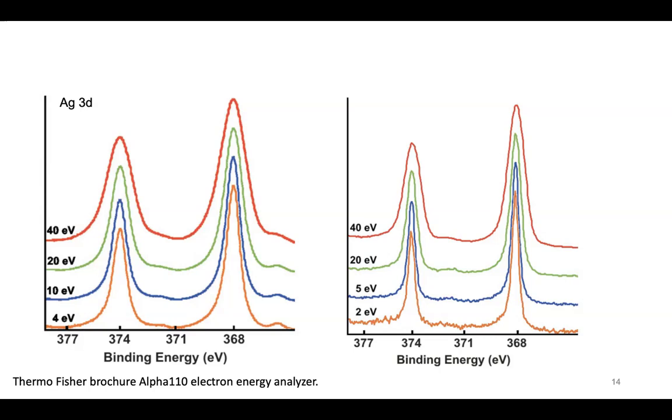If there are no overlapping peaks, can you live with something like 10 eV pass energy, collect 3 scans at 20 minutes each, and then be done with your data collection? But you can always get higher resolution.